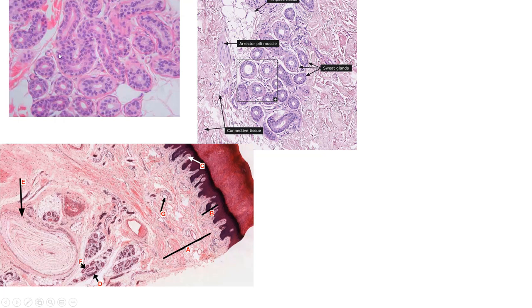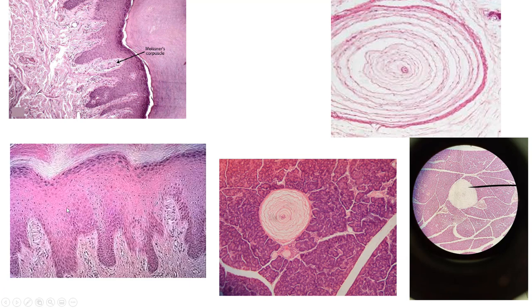More pictures of sweat glands — this is really zoomed in. Here's a big sweat gland: when they cut through that coiled up region it looks like a bunch of circles. Over here are more sweat glands, and then here's a Pacinian corpuscle right here. Moving on to sensory receptors — Pacinian corpuscles sense pressure and vibration.